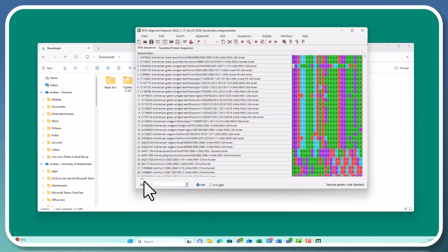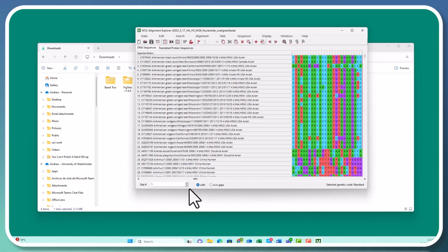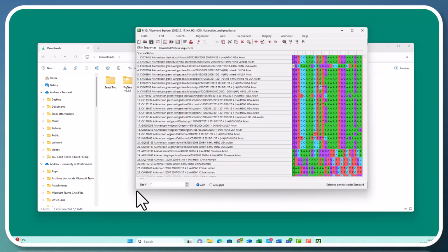It's also important if I'm going to do any edits based on missing data, because it helps me to make decisions. If I find that there's 5 sequences that all came from the same location at the same time, and one of them has a lot of Ns in it, so a lot of missing nucleotides which are incorrectly assigned, I don't really mind about deleting that.